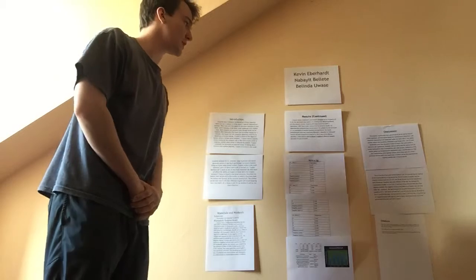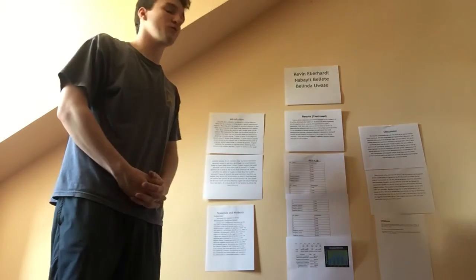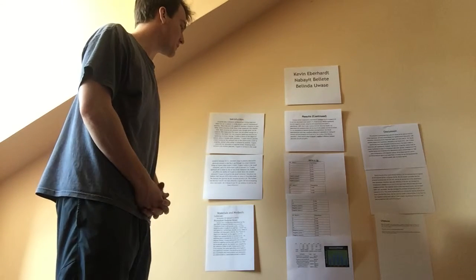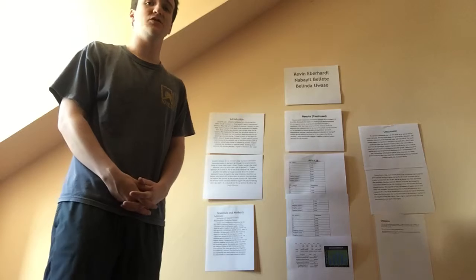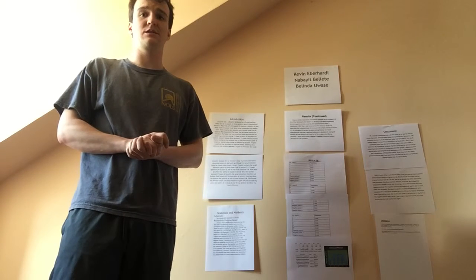Hello, my name is Kevin Eberhardt, and today I'm going to be talking about an experiment and a study that my group did on varying levels of pH and its effect on the ability of the enzyme trypsin to hydrolyze the protein azocasein. But before I get into that, I wanted to discuss briefly what an enzyme is.